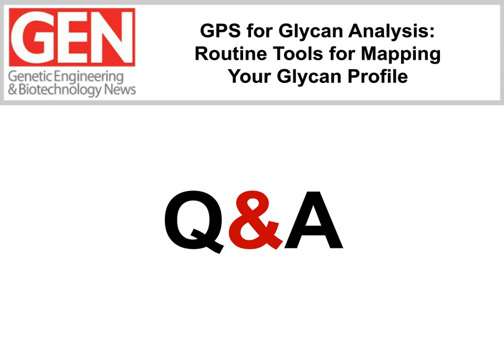And are issues with capillary clogging common with this instrument? That is, how often does the capillary need to be changed? So that's a good question. What we have seen in our experience, we've been running this application now for probably about a year. There are no massive problems with capillary clogging. And in general, across the variety of applications we've used the QDa for, capillary clogging does not seem to be a large issue. That's primarily due to the fact that the eluents are not high salt containing. So I would say no, it's not a large issue.